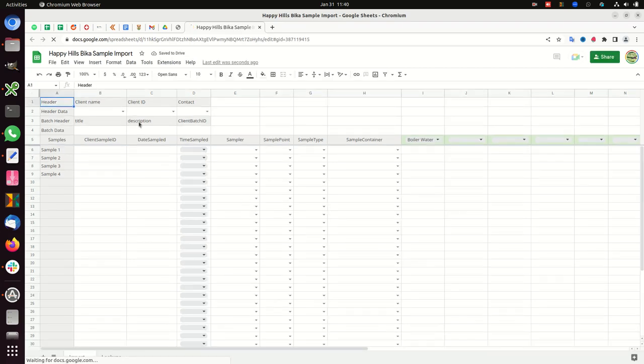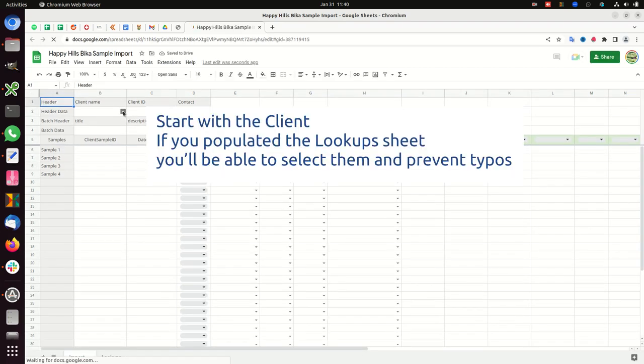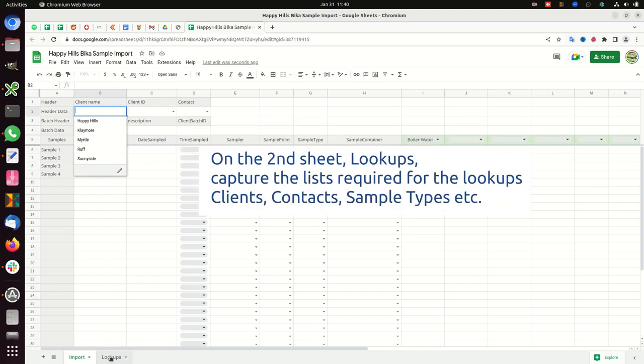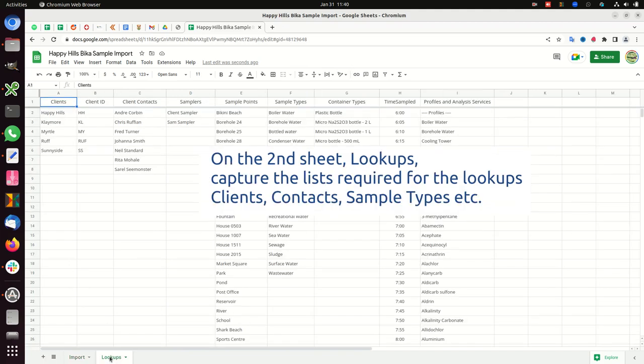Start with the client. If you populated the lookup sheet, you'll be able to select them and prevent typos. On the second sheet, lookups, capture the lists required for the lookups: clients, contacts, sample types, etc.